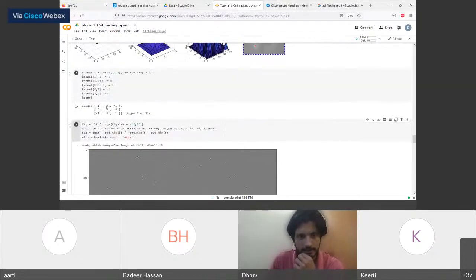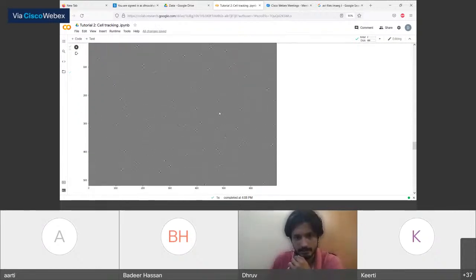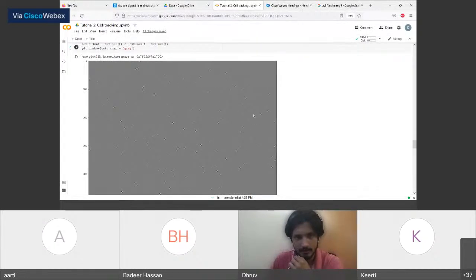This kernel is defined with the mid section of both x and y as zeros, and the top left and right regions are 1, one positive and one negative. At every place, this particular computation is being calculated. The pixel values at the top right and bottom left are being subtracted, while the pixel values at the top left and bottom right are being added. This changes my image interpretation, and results in this kind of image, where all the spots have been convolved and their representation transformed.